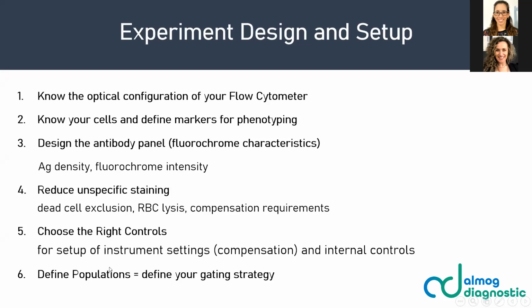And last but not least, defining the populations of interest, meaning the gating strategy. When you want to see a specific cell population, you need to know what would be the most correct and accurate gating strategy in order to accurately look at your data and get good statistics out of it.